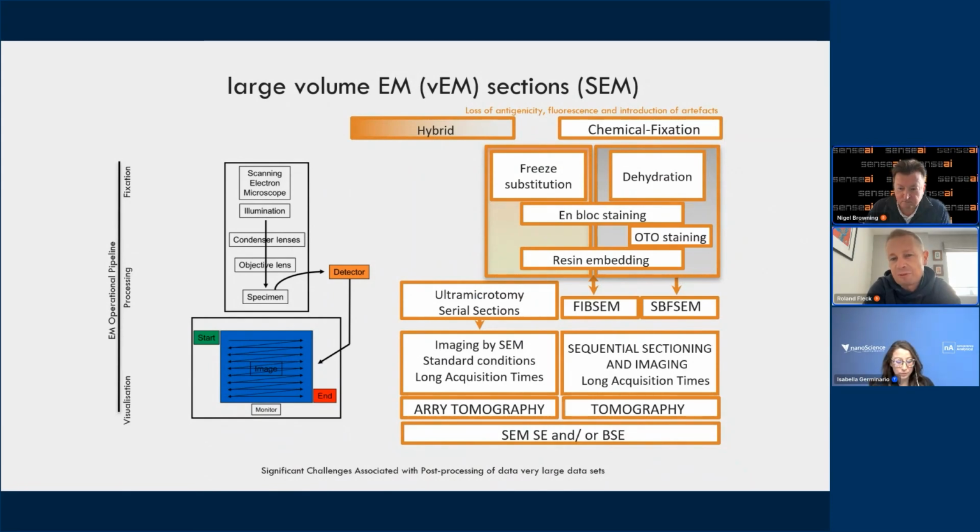So as an example, if you could scan an image in, say, a quarter of the time, if we're saying 12 months as an off the top of my head number, you'd be doing this in a quarter of a year instead. So there's a big gain. It's not just time, there's also a risk factor.